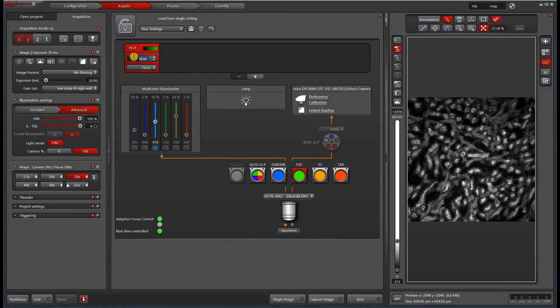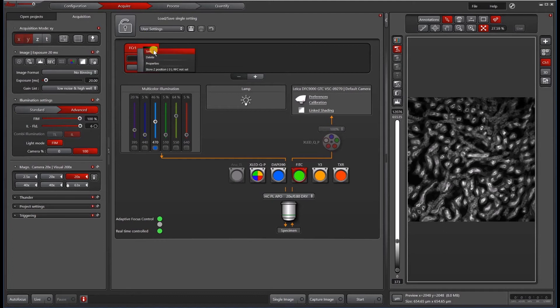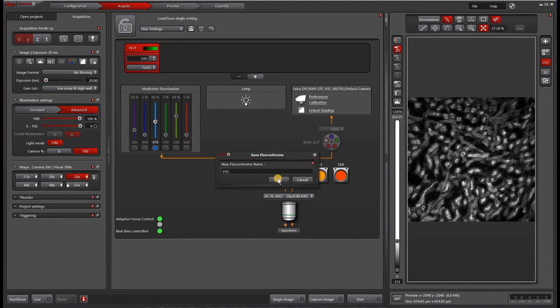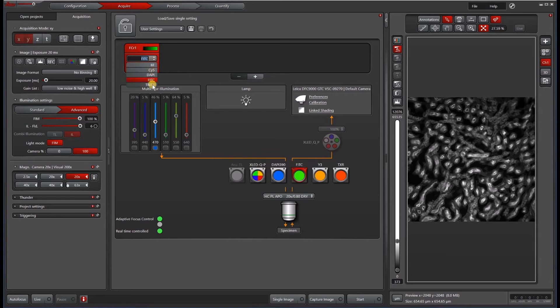After you've selected green, type in FITC for the name, whatever you want, then right click and hit save. And now you have that under the menu here.